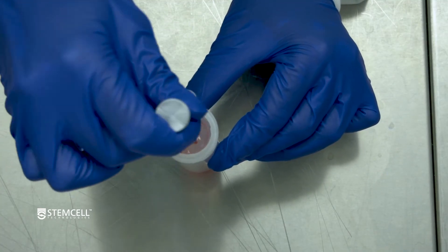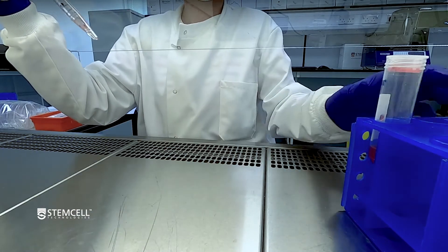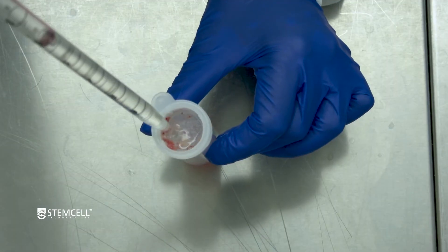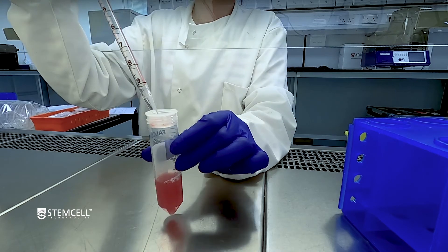Gently pass the dissociated tissue through the strainer. Rinse the empty spleen dissociation medium tube and mesh filter with an additional 10 milliliters of PBS containing 2% FBS and add it to the 50 milliliter conical tube.